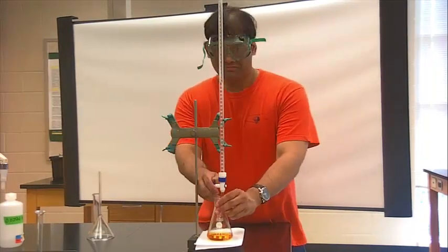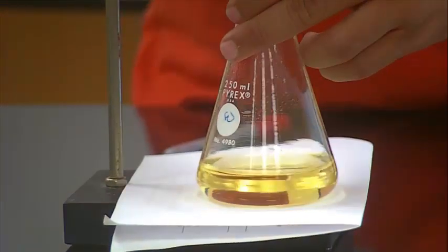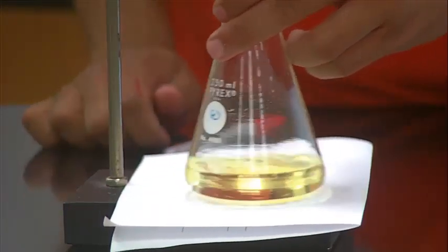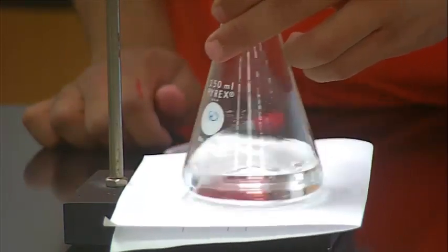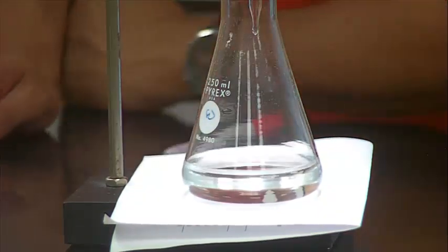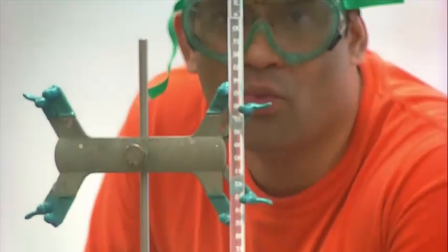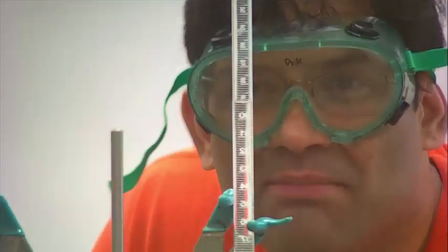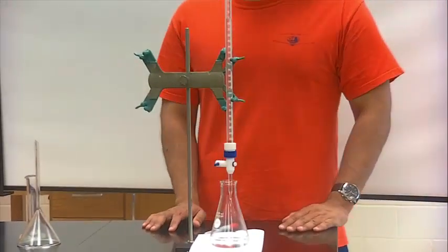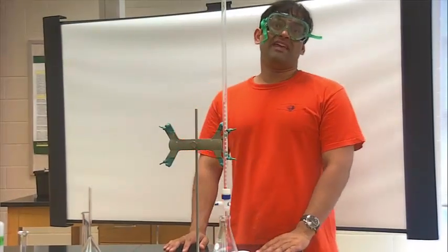Okay, any moment now. I'm going to go 1 mil. Okay, so I'll read that, and I have about 29.13 mils. That is my trial titration, 29.13 mils. I'm going to do this again, repeat the experiment, and do my exact titration.